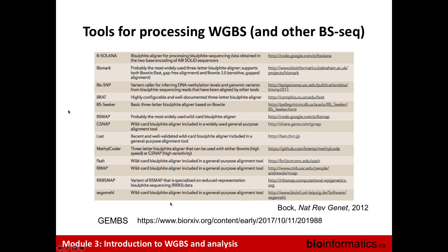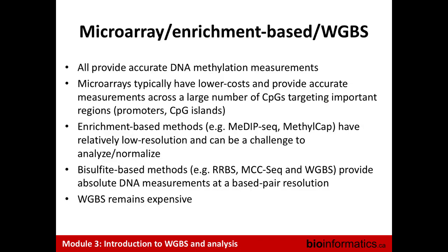I've added one of the latest tools for bisulfite sequencing data, and there are some bonus slides in the presentation that are not in your book. That includes a comparison with this latest tool that's used for whole genome bisulfite sequencing. So again, this is what we're going to go over.